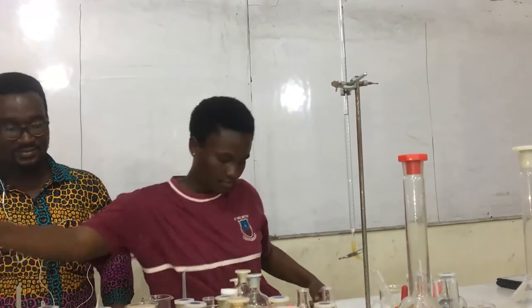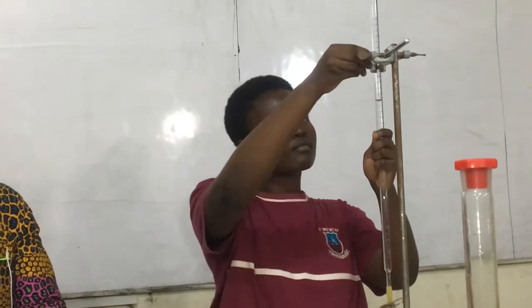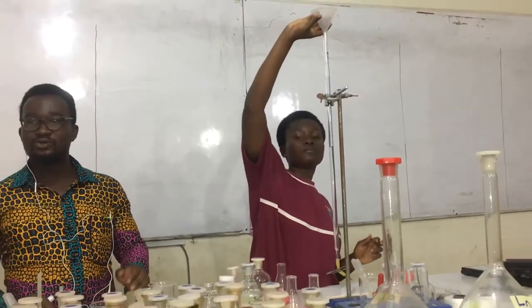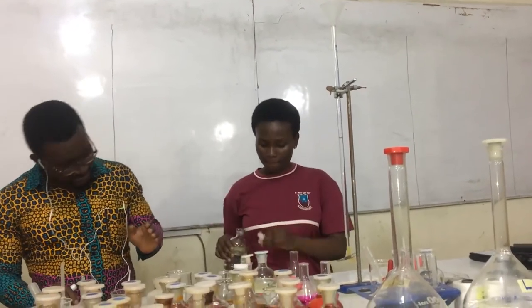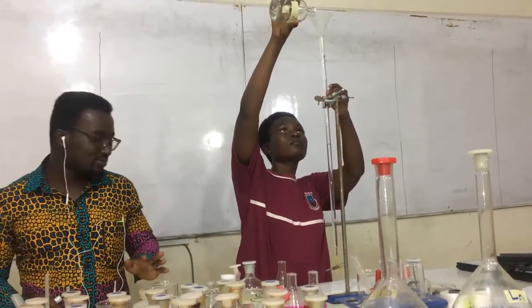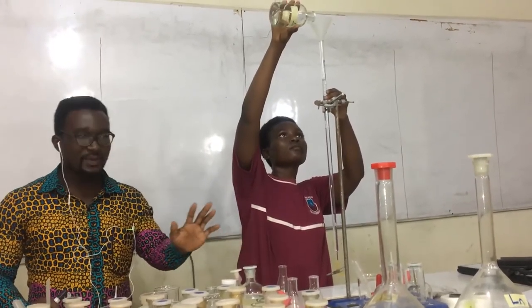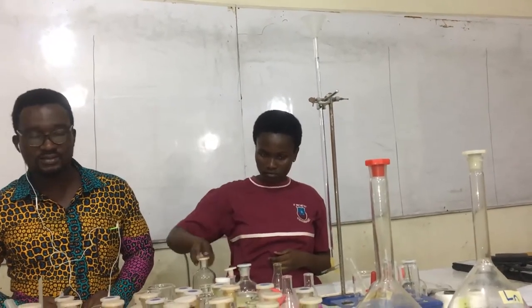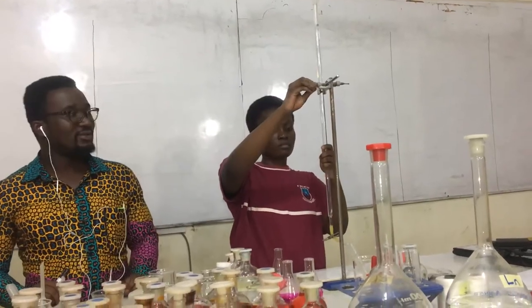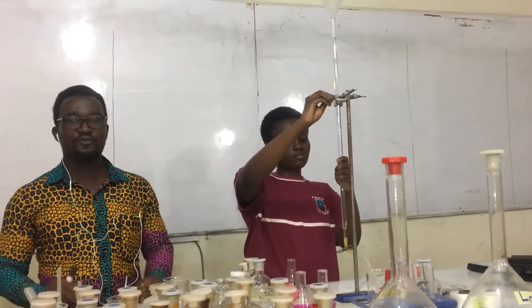Pick another one and then do the last one. You see, she's so careful to the extent that she makes sure the tip of the burette does not touch the floor, the workspace. Otherwise, the tip of it will be contaminated. So we don't just make any form of practice. Go through careful practice.